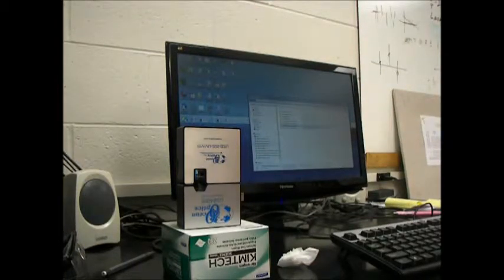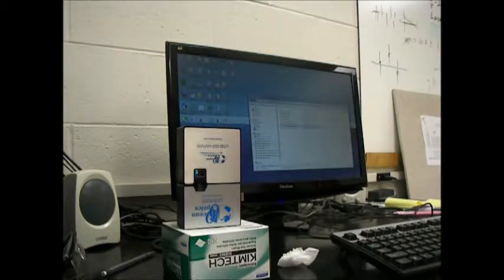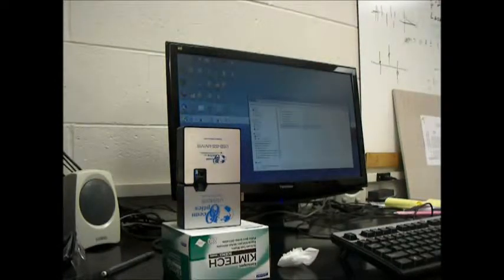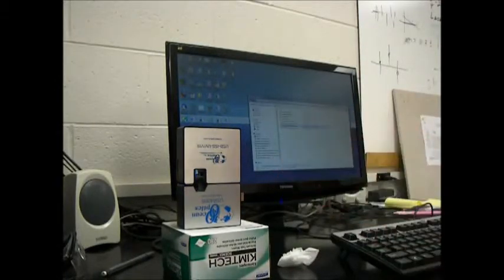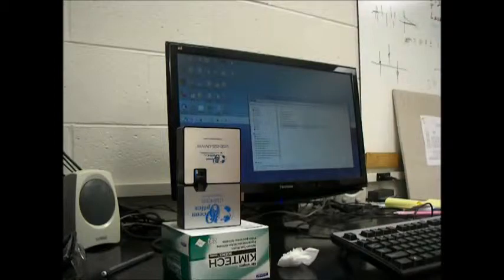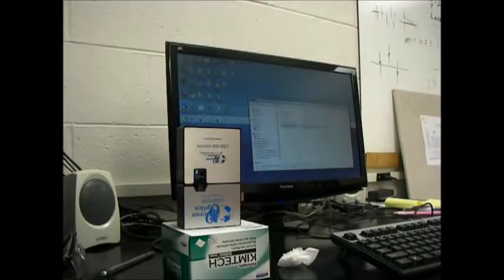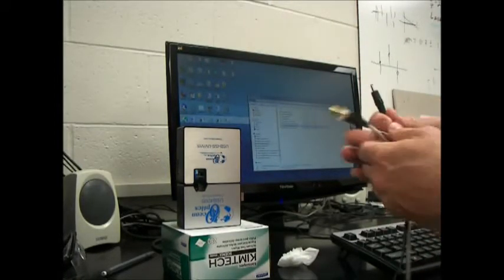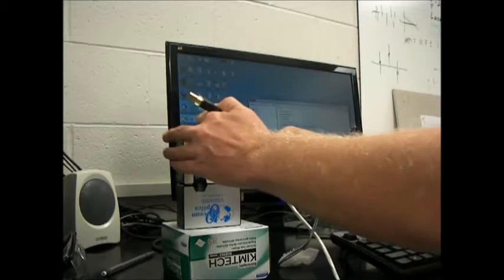This is how you set up and take measurements for semiconductor gas spectroscopy, and also how to calibrate this Ocean Optics USB 4000. The first thing you do is plug it in. Plug in power first.